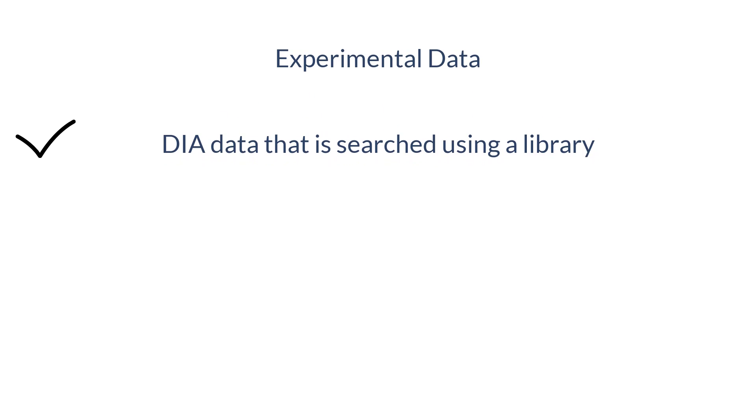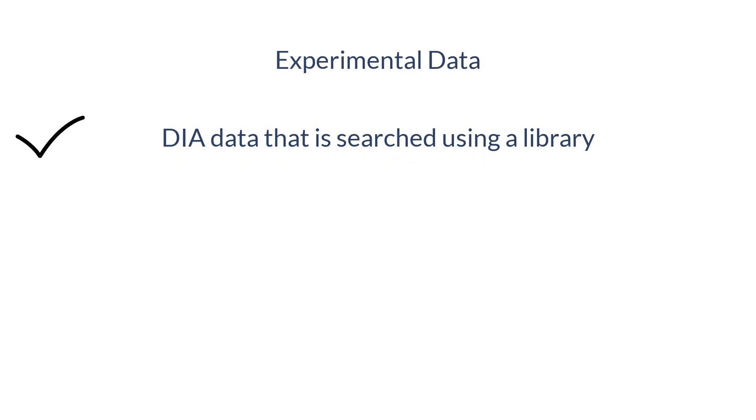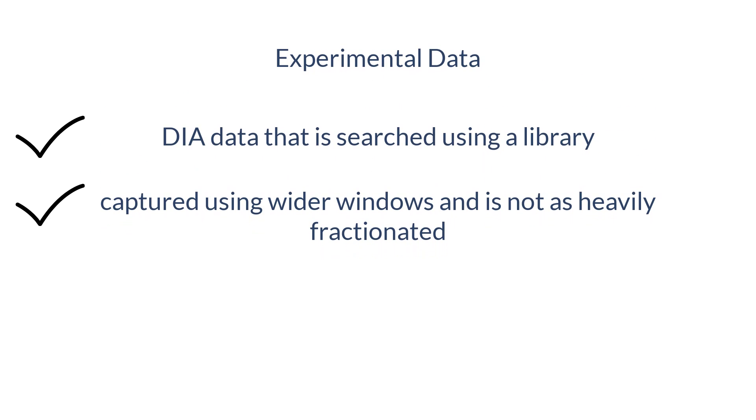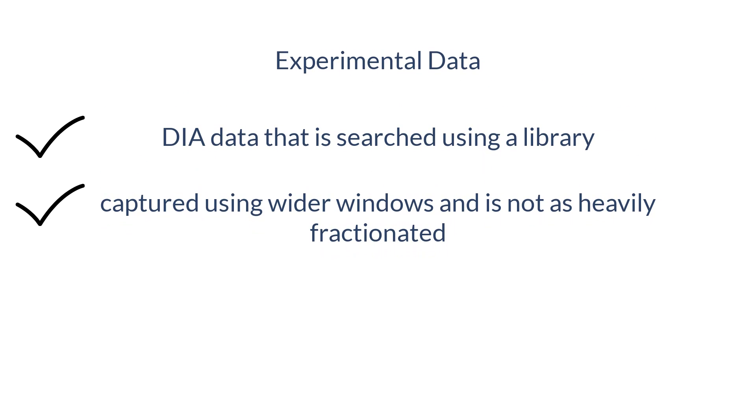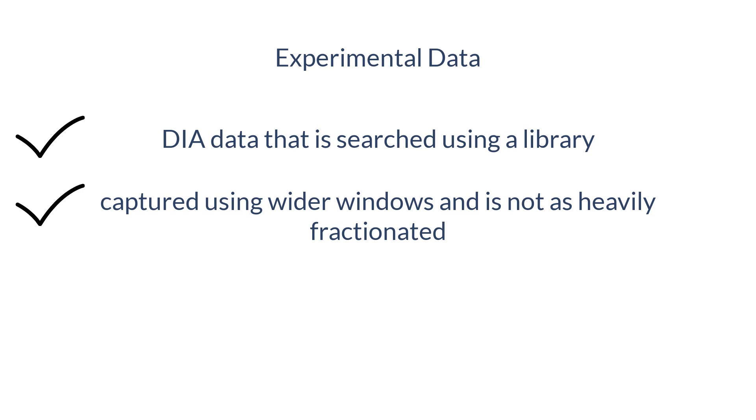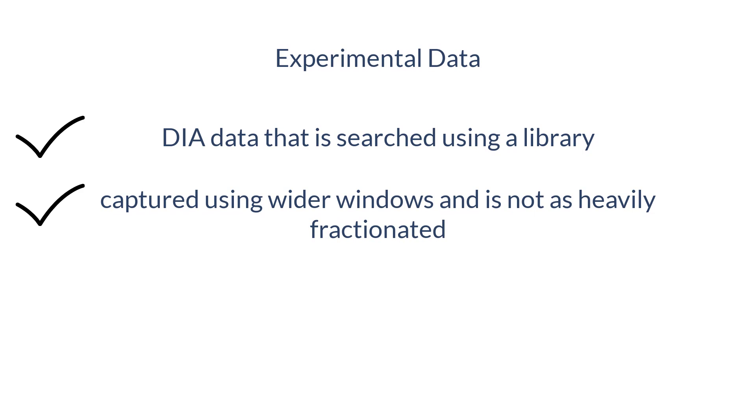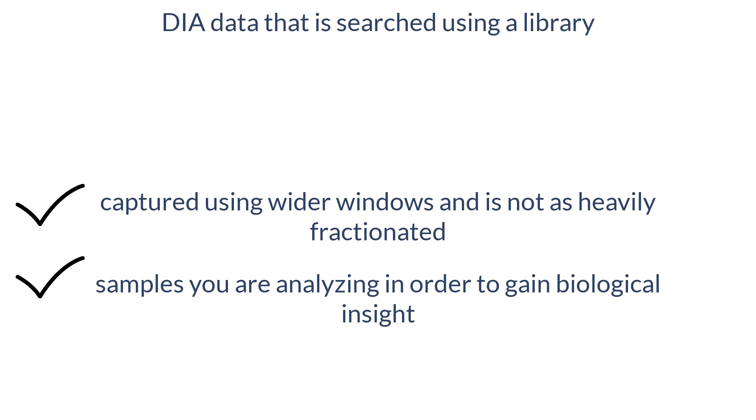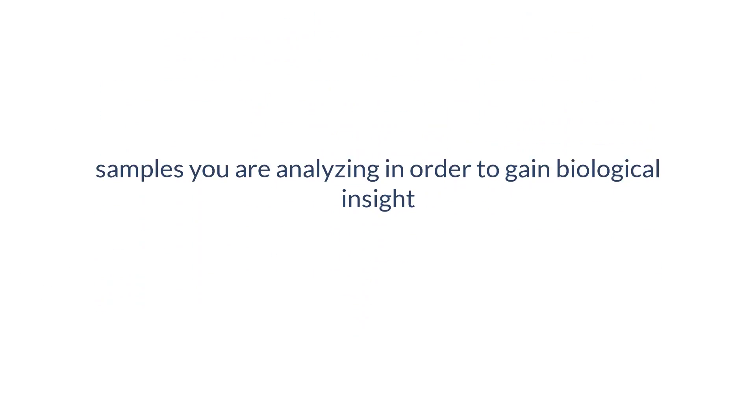Experimental data is DIA data that is searched using a library. Most experimental data is captured using wider windows and is not as heavily fractionated. These are samples you are trying to analyze in order to gain biological insight.